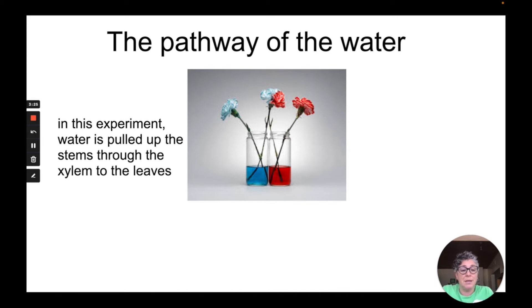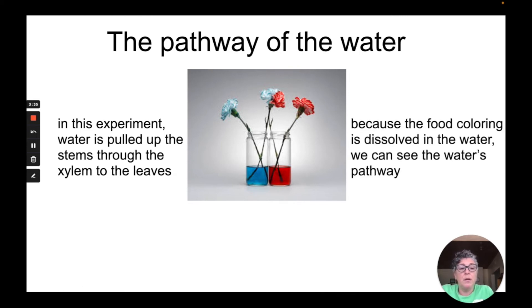This is another classic example of this type of experiment using white carnations to see how water moves up through the stem. Because the food coloring is dissolved molecules in the water we can actually see the water's pathway through the stem and into the vascular bundles of the leaves.